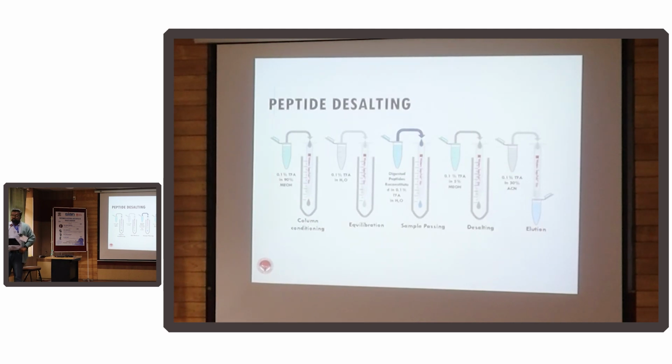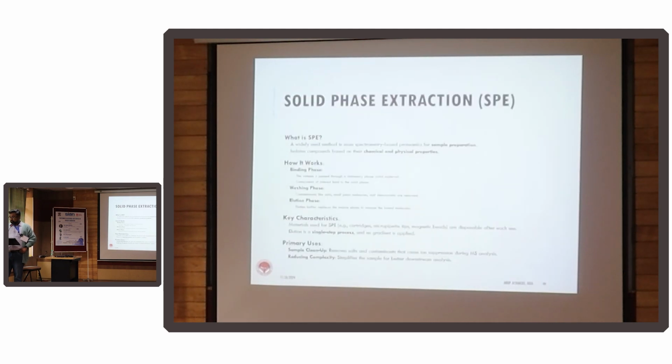A good way of understanding that the purification has been done well is you won't be able to distinguish a microfuge tube that has peptide from one that does not have a peptide. But if you start getting yellow spots or maybe faint white spots, that means you have done something wrong somewhere, and peptides are usually colorless. You don't see them.